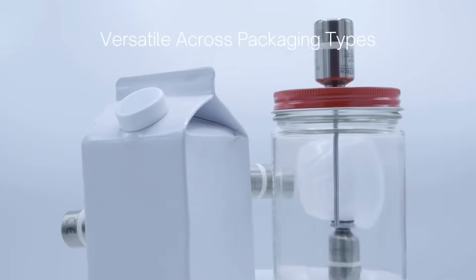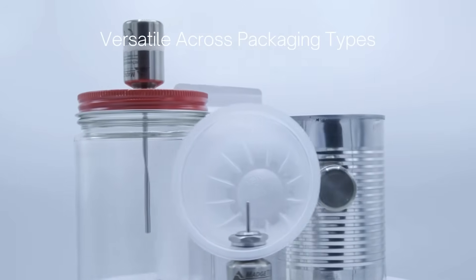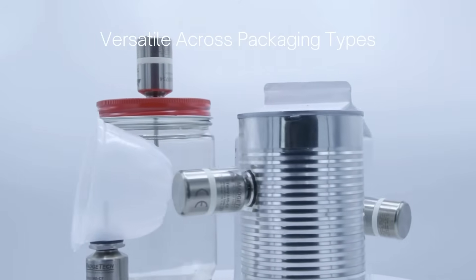Designed for versatility, the HITEMP 140-CF is ideal for a variety of food packaging, including cans, bottles, and retort packaging.